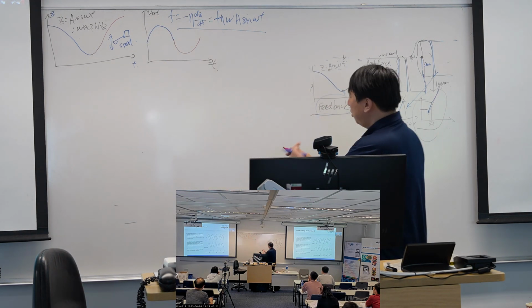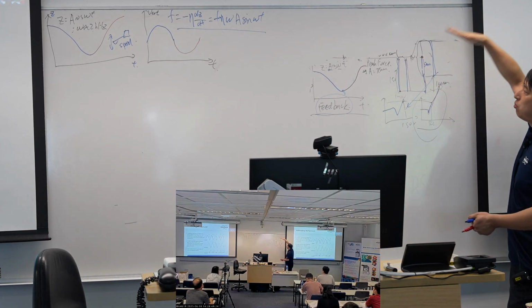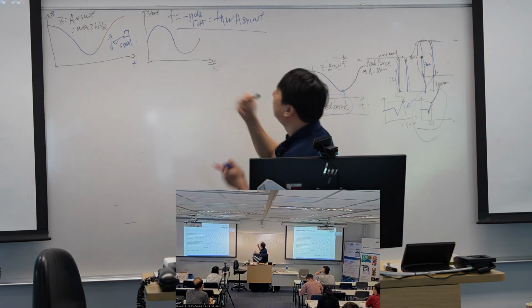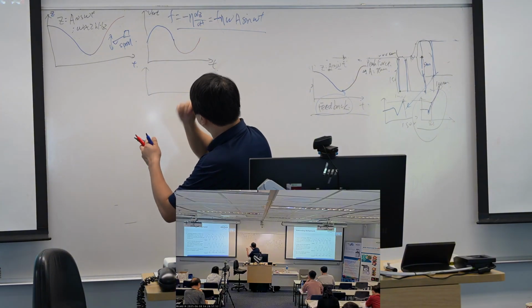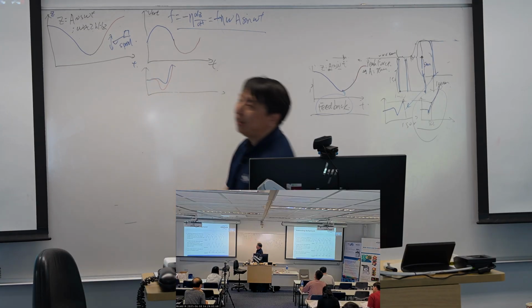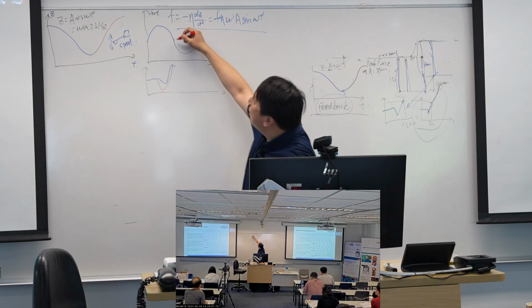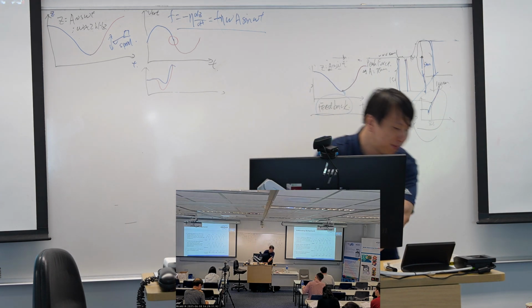And we know we have a sample beneath our probe, so the probe will touch the surface. It will have a force curve, something like that, which means there should be a sample around this region.